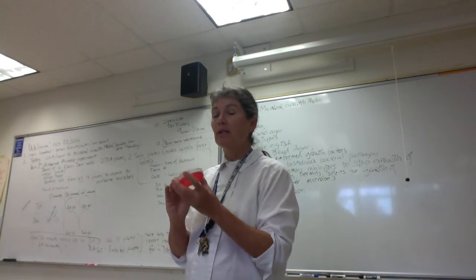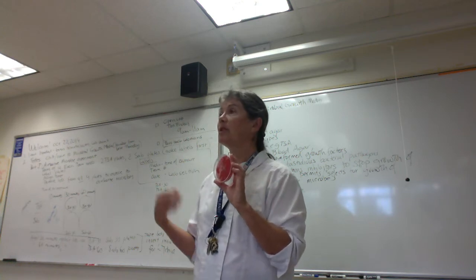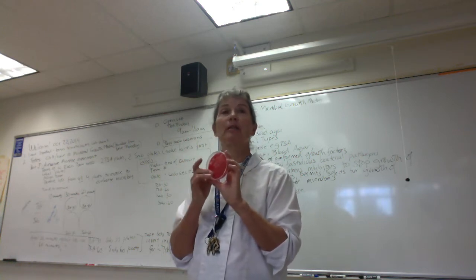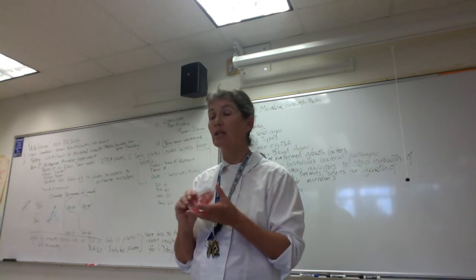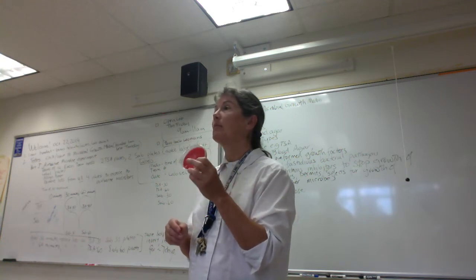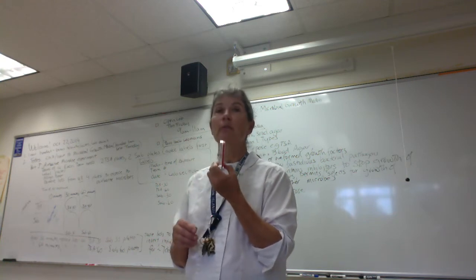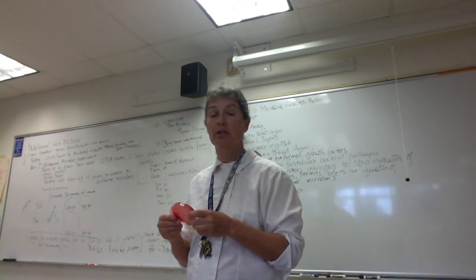So definitely in microbiology diagnostic labs, when you receive a sample, you're always going to put some of the sample onto blood agar, right? Because you don't want to miss those fastidious bacterial pathogens. We're also going to see, folks, that in addition to being an enrichment media, blood agar is also what we call a differential media, and we're going to come back and talk about why blood agar is differential.